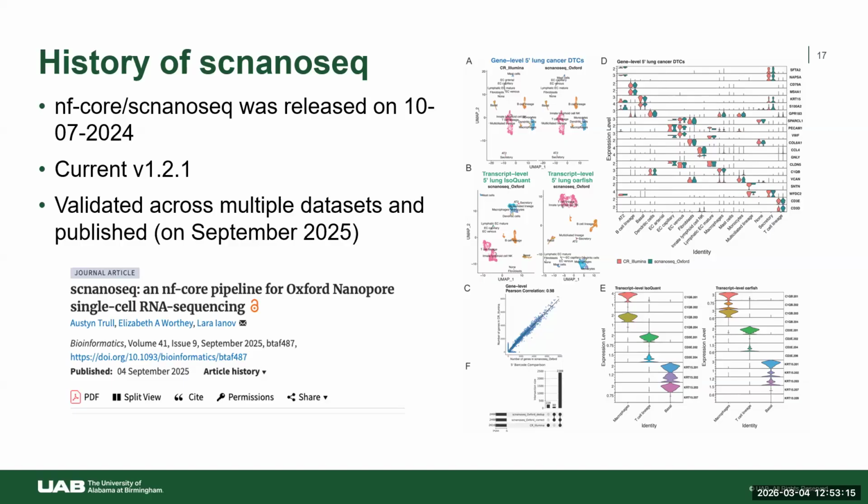Because I don't want a quick tool that's not going to do a good job. So I wanted to very carefully evaluate these methods against what I call ground truth data, so that I can clearly see: am I actually capturing the proper single cells? Can I quantify that?